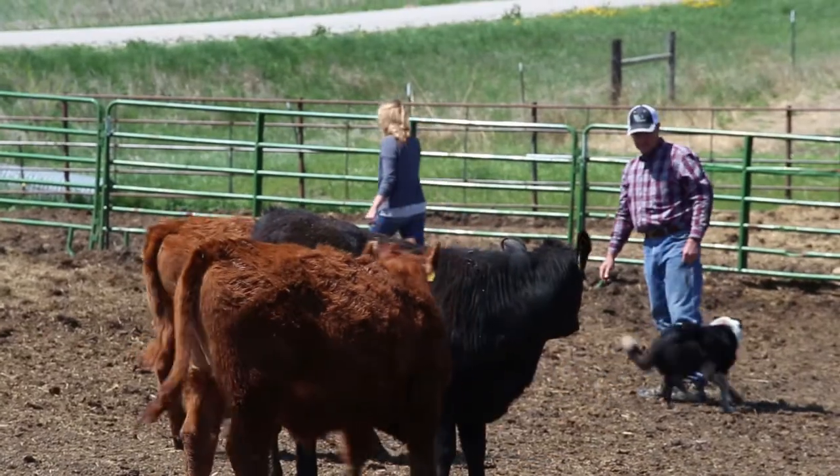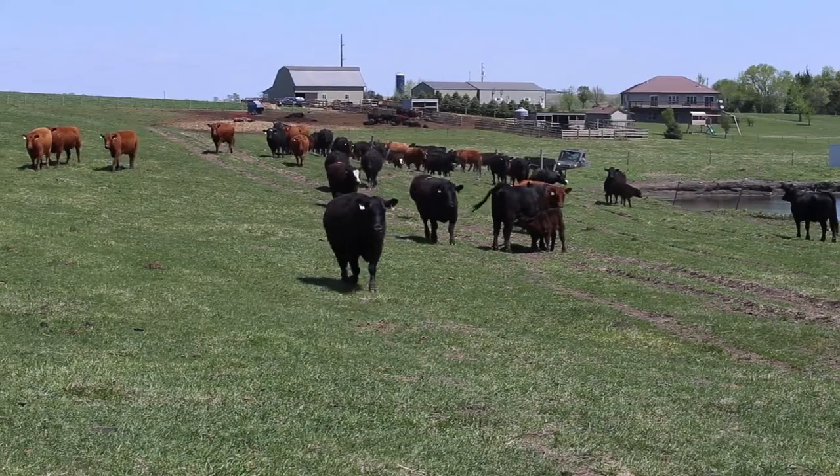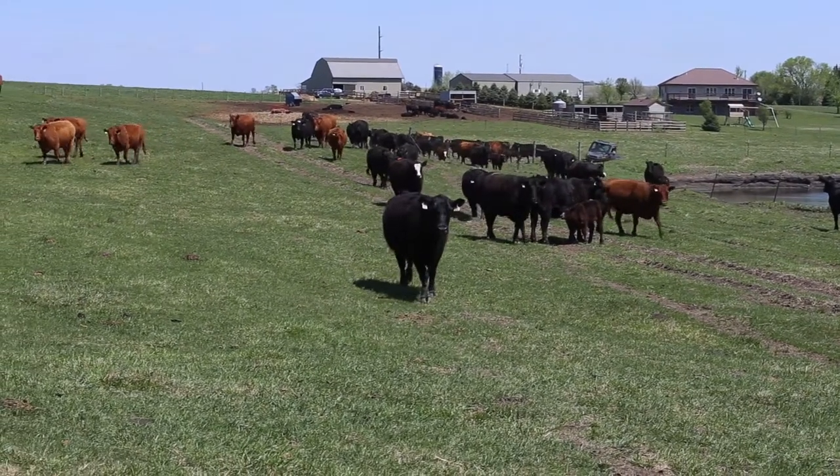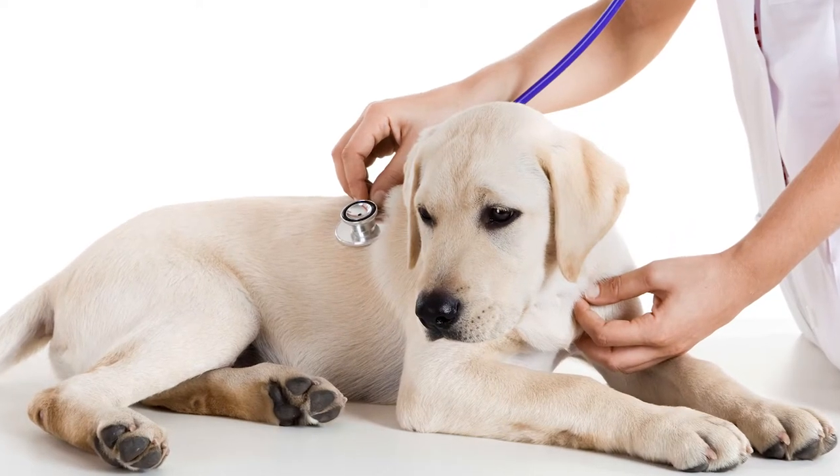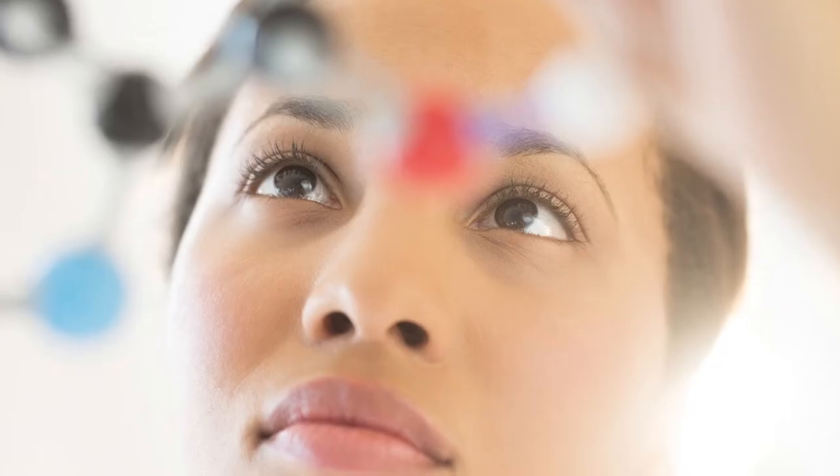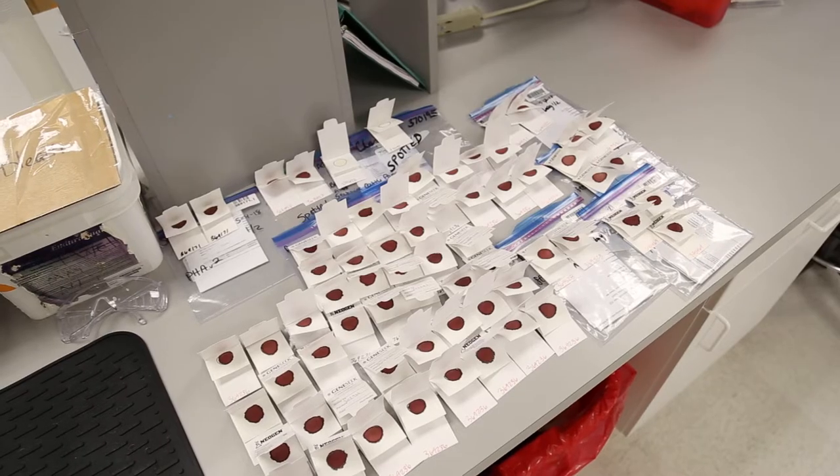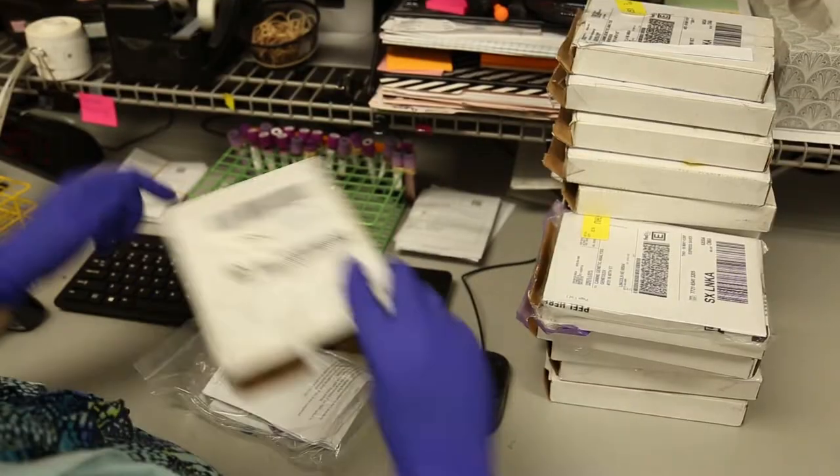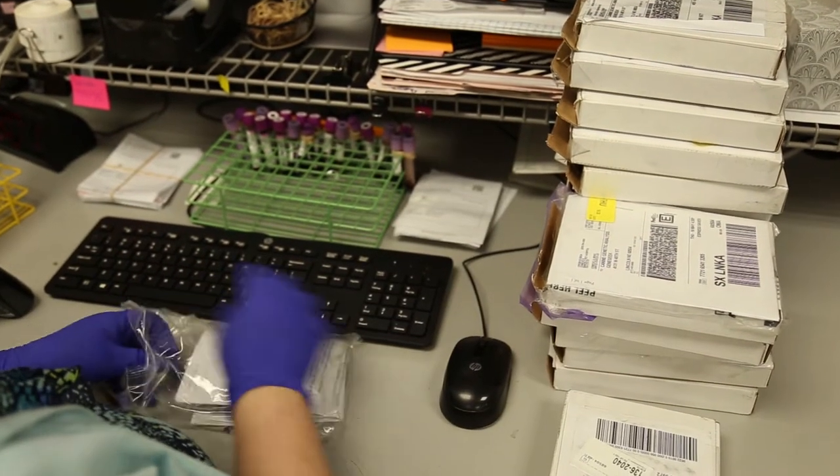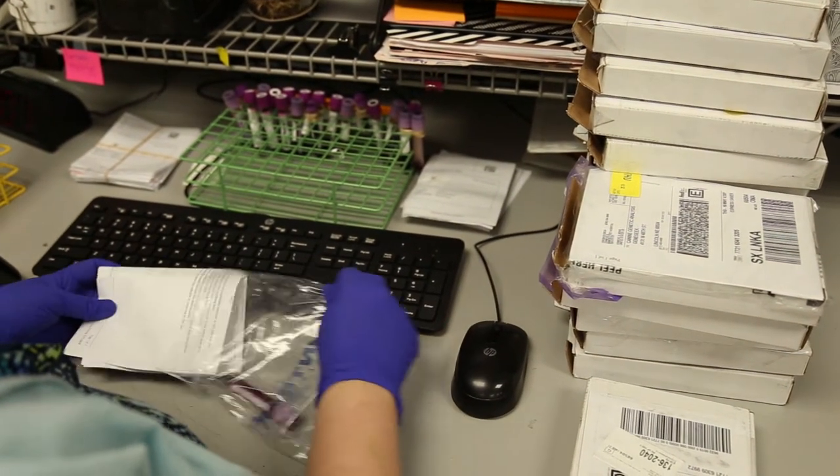Imagine a family cattle operation that wants to make better long-term decisions about how it breeds its herd, or a veterinarian seeing a new puppy for the first time, or a geneticist at a leading university working on better ways to feed the world. For all of these customers, the DNA testing process begins by sending a sample from an individual or group of animals to Neogen.